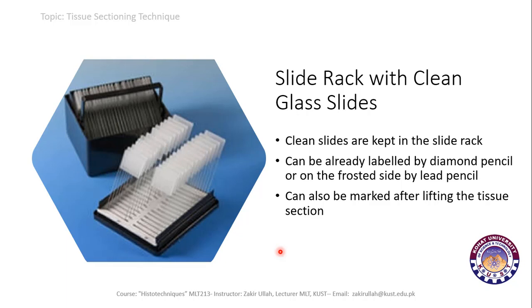The slide racks are used to keep slides in them. These slides can be already labeled with a diamond pencil, or on the frosted side with a lead pencil. The slides can also be marked after lifting the tissue section. Here are the slides in which the frosted side is here, and the two different types of slide racks.